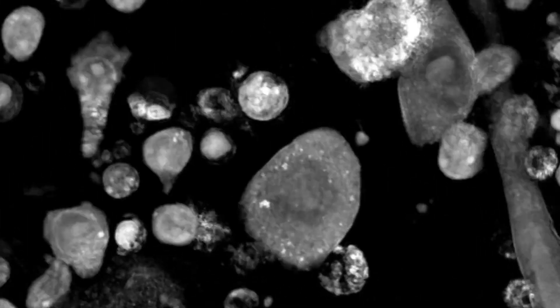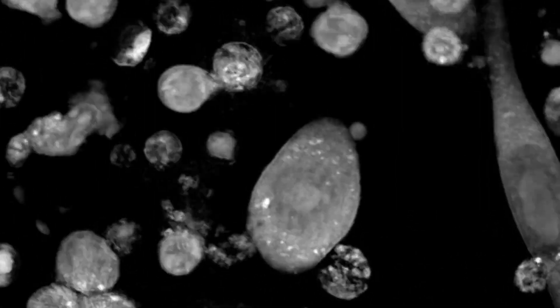we're looking at an image from 360 degrees all the way around the image and then creating a hologram based on interference patterns between a reference beam of light that goes around the sample and an extremely low-powered beam of light that goes through the sample.